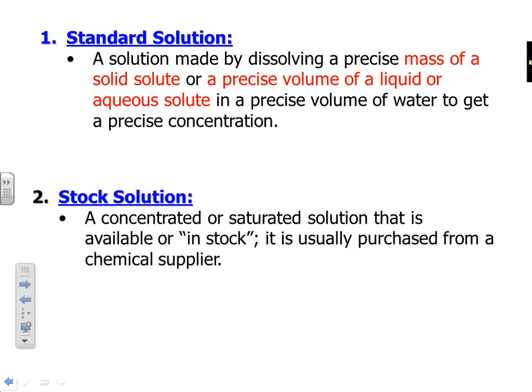So if I wanted to measure 200 milliliters in this beaker, I'd have to try to line the surface of that liquid up with that line, the 200 milliliter mark. It's difficult to line that big, large surface up with a little line that's on the side. Also, if I make a mistake and I put a little too much in, because of the large area of the mouth, a little addition will have a big volume because it's going to have a mistake that's that big around. So we need a more precise measuring device than a beaker.